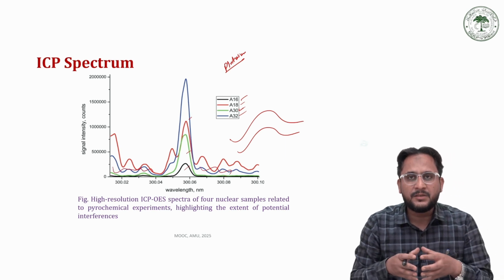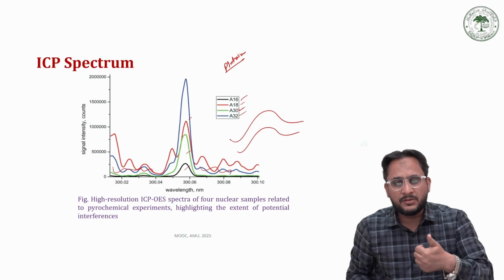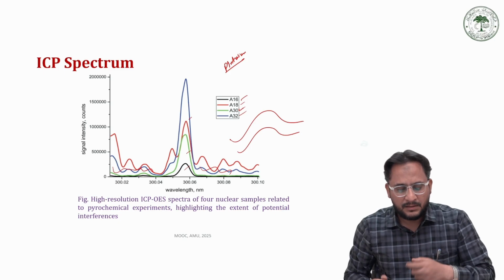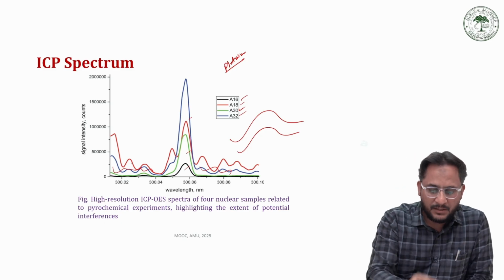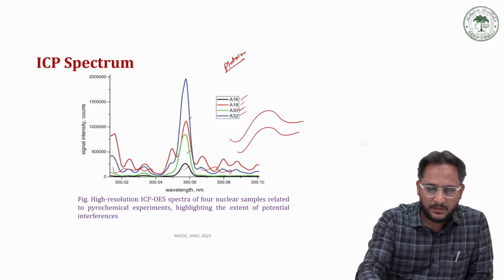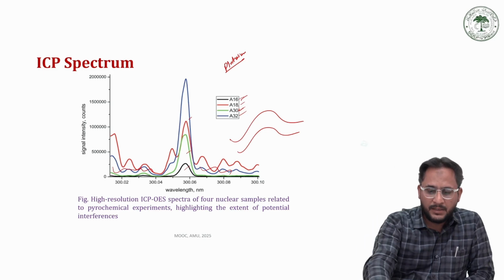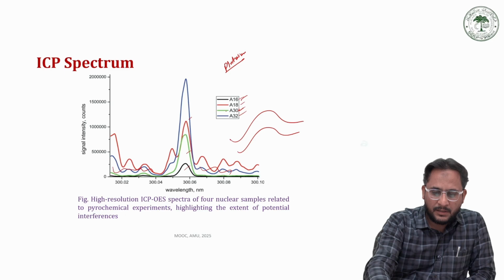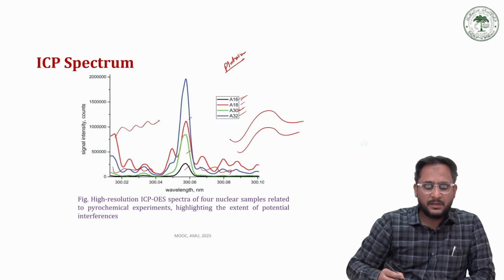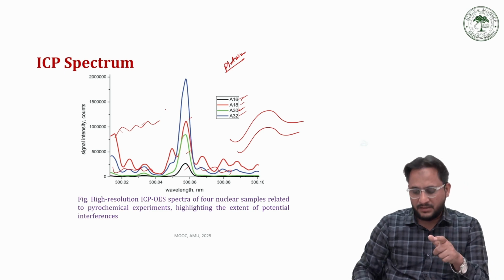This shows the sample is being disintegrated, and because of the emission of alpha and beta particles, these lines have been disturbed. So A16 and A30 mean the sample is in good state, while in A18 and A32, in the red and blue color, we have multiple peaks and shoulder peaks, which means the sample has been disintegrated.